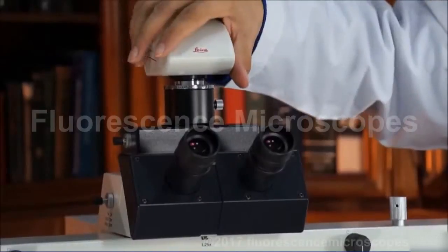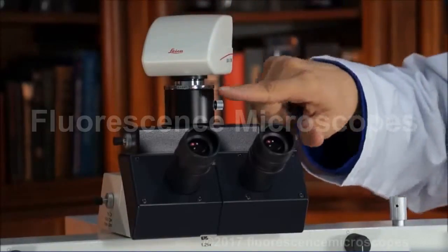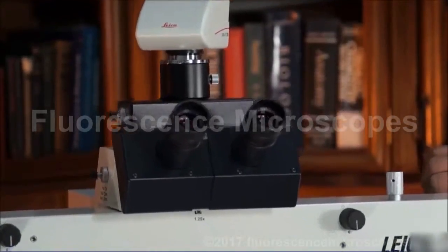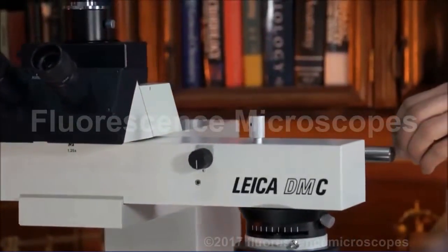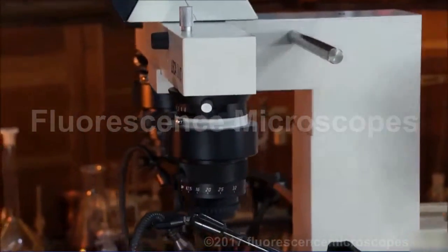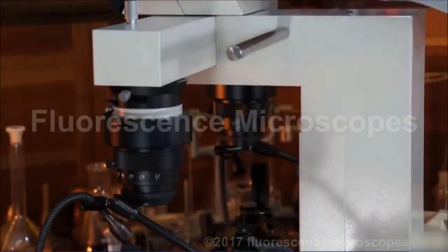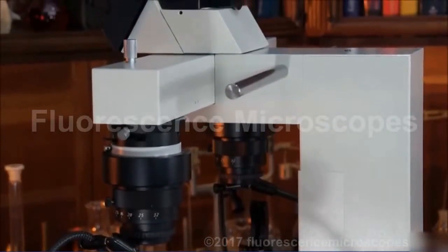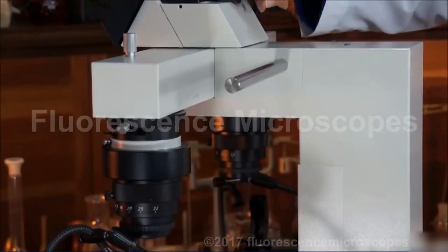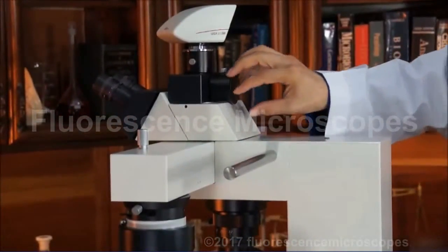We've got a camera — this camera's not included; we include a different style of camera, but you can also put your own camera on it. This has got a C mount, and the C mount is included. These are carrying handles — this is a very large and heavy microscope, so these carrying handles really help. I suggest you also have somebody lifting from the bottom, not just the top. We also have another camera port or video port in the back, so you can put one camera on the top and another camera like a video camera on the very back.